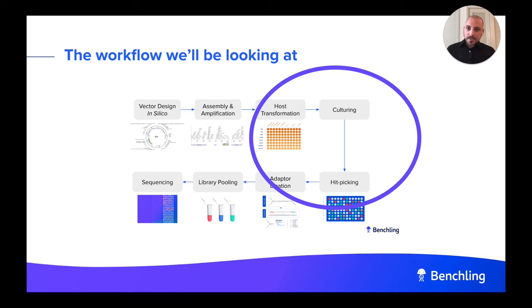So what we're going to look at today is how lab automation actually works. If you're a scientist, what do you actually do? We're going to focus on a screening workflow, and on these 3 steps I have circled here: how to make plates for a transformation, how to generate and consume the output file of an OD600 assay, and then how to do the hit picking.